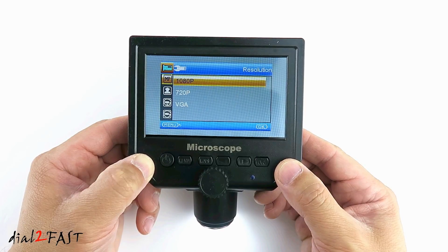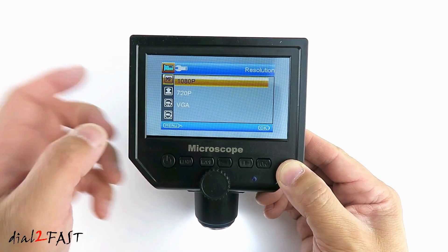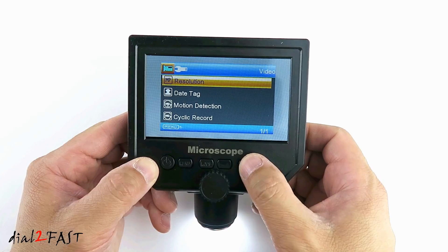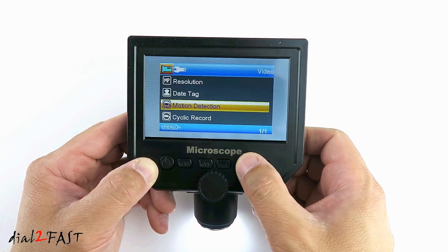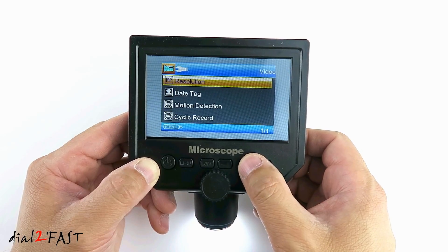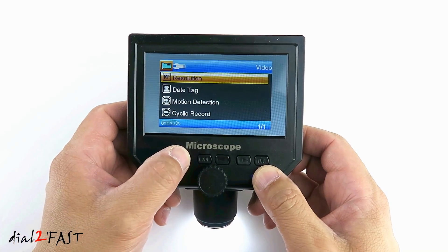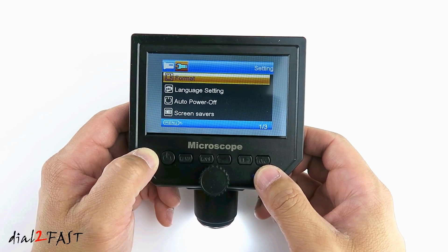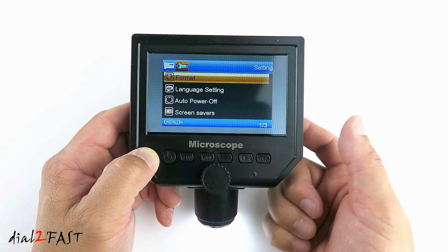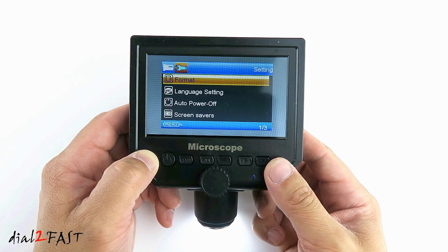Resolution default is 1080p — you can change this to 720p or VGA. Date tag: you can add a date to the recorded image. Motion detection. Cyclic record. Press the menu again and this is the unit setup menu. First item is format. You can insert a memory card on the side right here and it will record a video or take a snapshot.